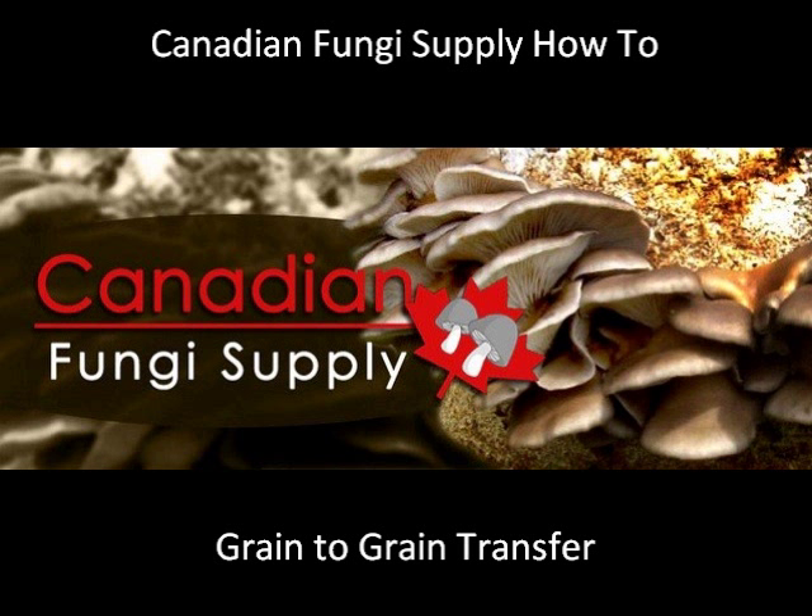Hello, and welcome to this episode of Canadian Fungi Supply How To. In this video we'll be going over how to do a grain-to-grain transfer in front of a laminar flow hood. Now, you don't need a flow hood to do a grain-to-grain transfer. You can just adapt these techniques and movements inside of a still air box. So, let's get going.